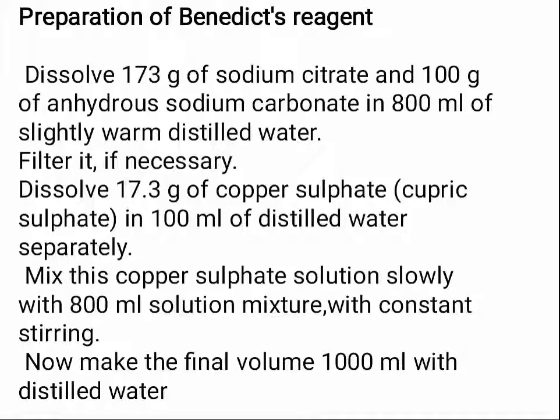Preparation of Benedict's reagent. At first dissolve 173 g of sodium citrate and 100 g of anhydrous sodium carbonate in 800 ml of slightly warm distilled water. Filter it if necessary. Then dissolve 17.3 g of copper sulfate in 100 ml of distilled water separately.